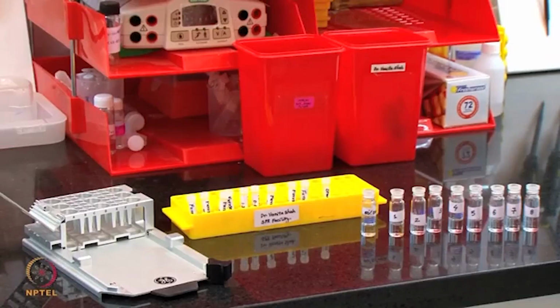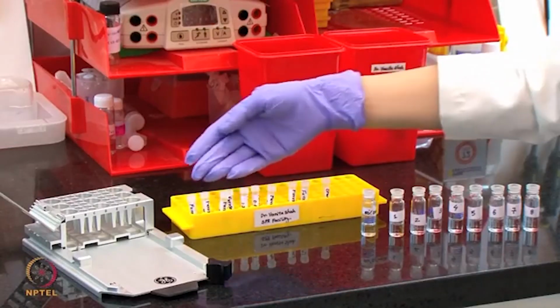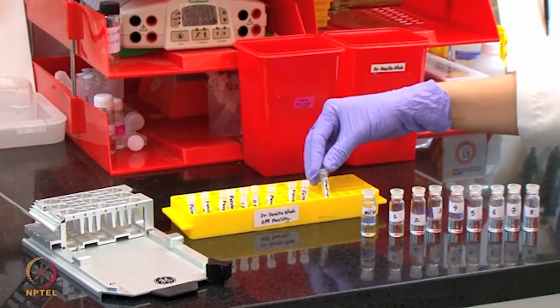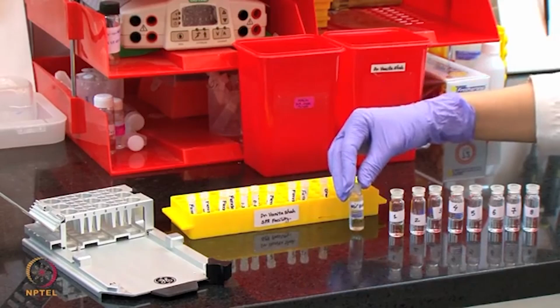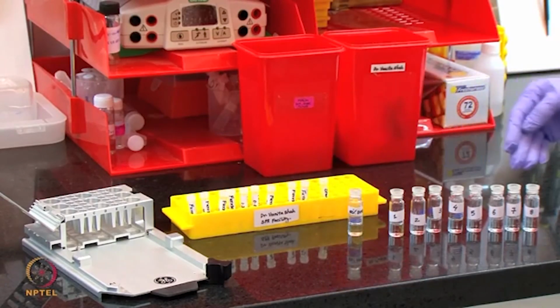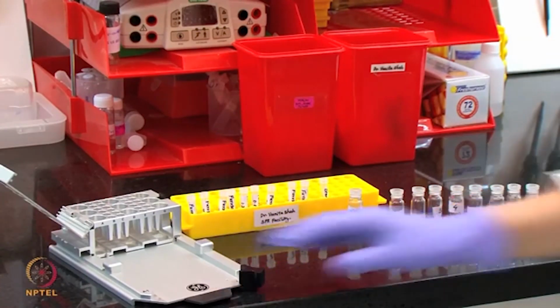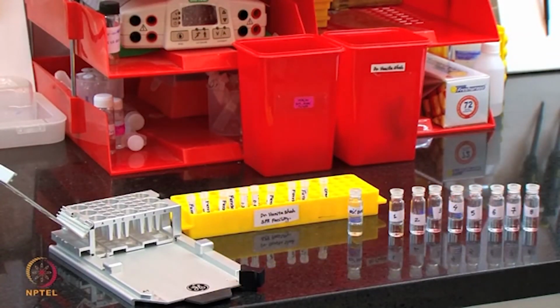We will now proceed to insert these tubes, including the samples, the startup, 50% DMSO and the solvent correction solutions into the appropriate rack and then into the system to perform the protein small molecule screening assay.